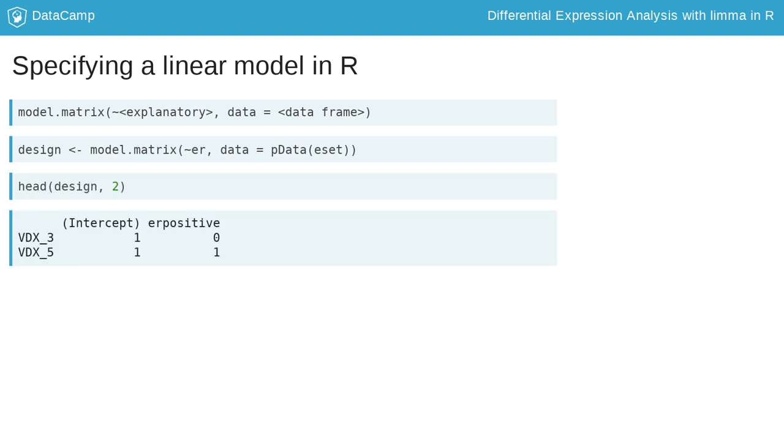Each column of the design matrix corresponds to a coefficient in the linear model. If the sample in a given row is modeled by this coefficient, then it has the value 1 and 0 otherwise. Looking at the first two samples, the intercept is 1 because it is 1 for all samples. The first sample is ER negative and has 0 for beta 1. Conversely, the second sample is ER positive and has 1.